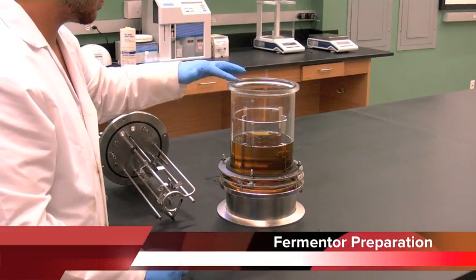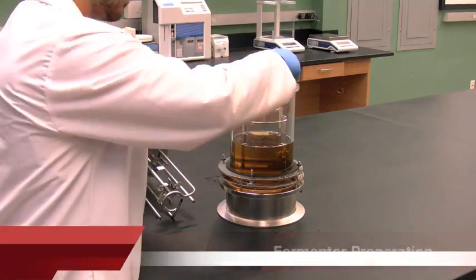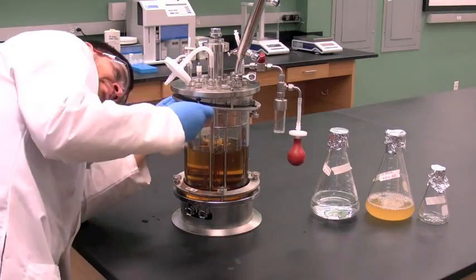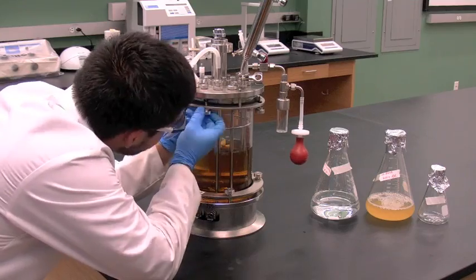Apply a thin layer of lubricant around the top surface of the glass vessel. Set head plate in place and secure metal rings using four bolts. Tighten bolts evenly.